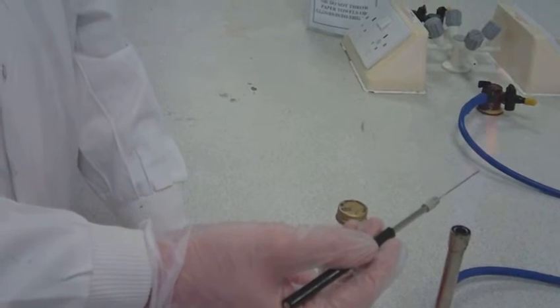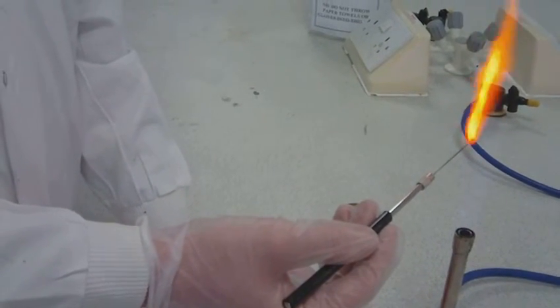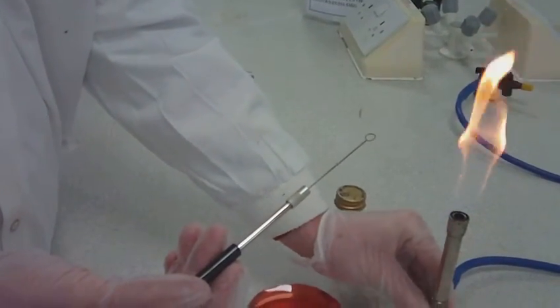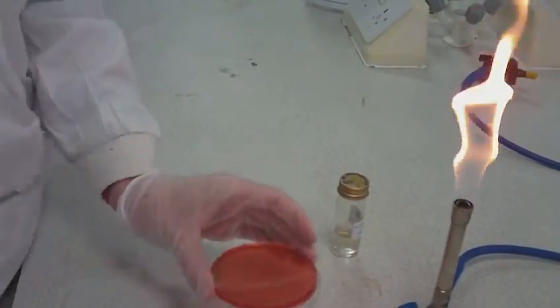Re-flame the loop to sterilize before putting away, turn Bunsen burner flame back to safety and then leave your agar plates on the side to be collected for incubation.